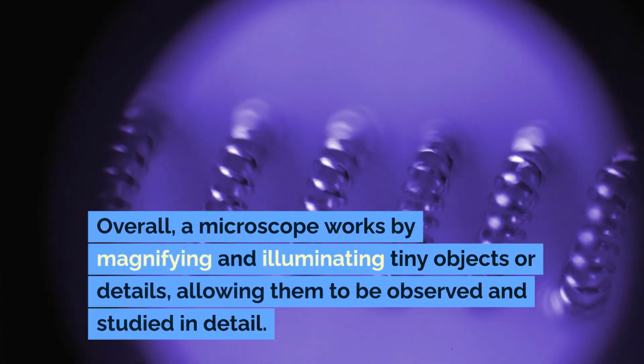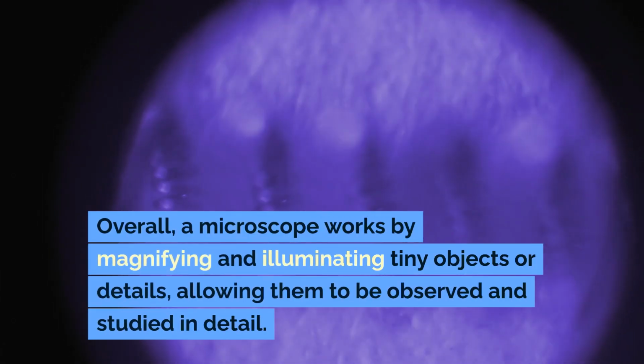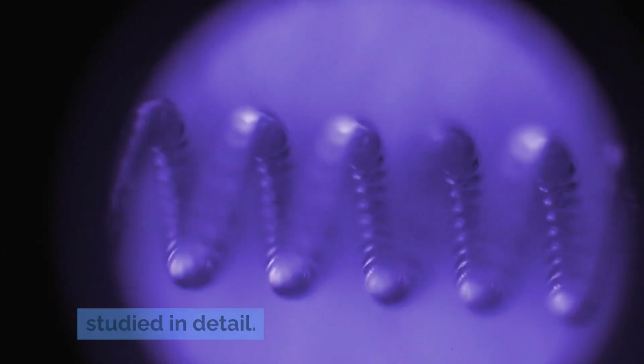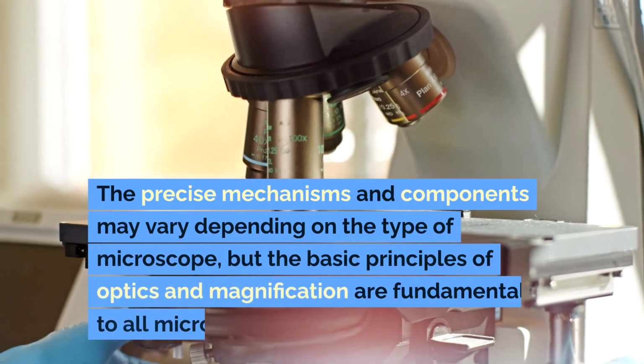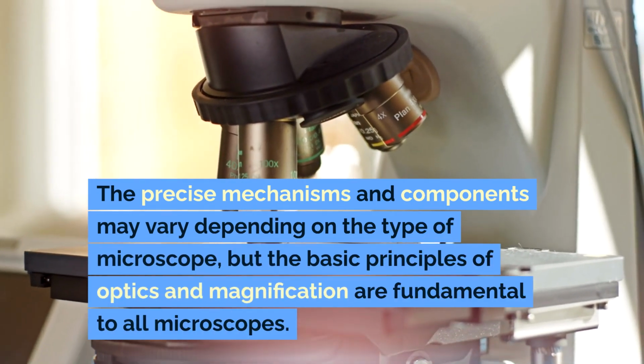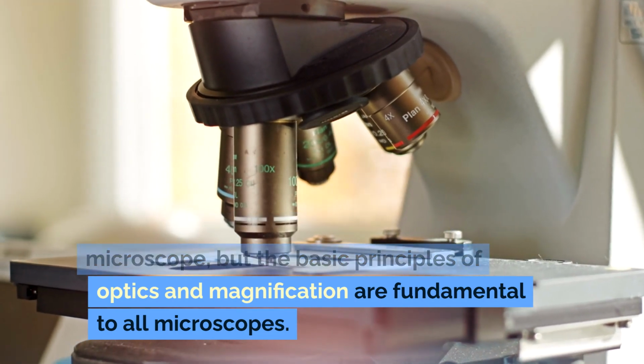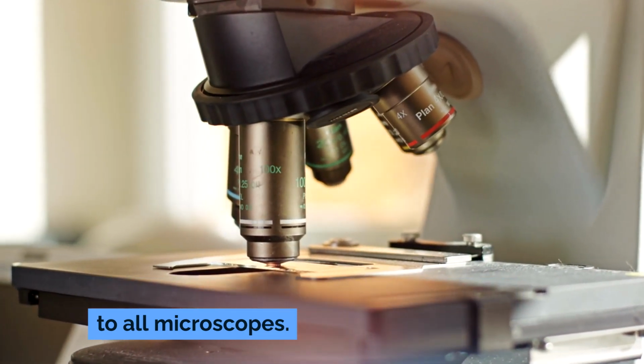Overall, a microscope works by magnifying and illuminating tiny objects or details, allowing them to be observed and studied in detail. The precise mechanisms and components may vary depending on the type of microscope, but the basic principles of optics and magnification are fundamental to all microscopes.